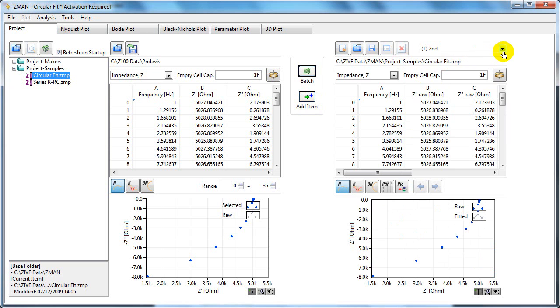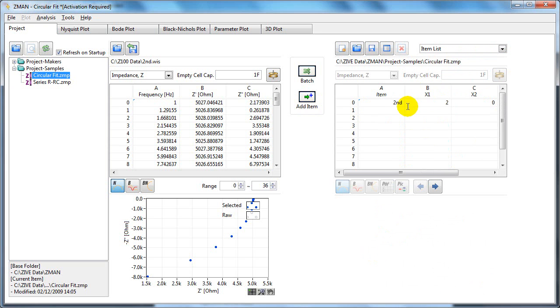So now if I go to the item list, we've just got our second file.